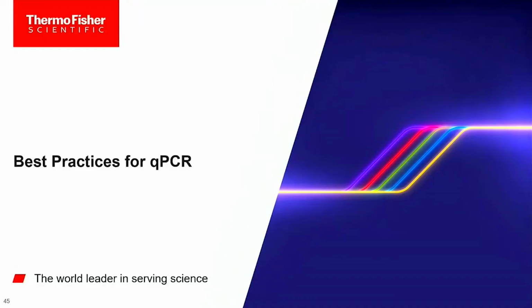If maybe I'll use it at some point, I'm going to put it in the freezer, -20 or -80, depending on when I'm going to come back to it and how deep into the storage archives this needs to be placed. So again, not a direct answer. Don't you love that? I'm giving you non-answers.